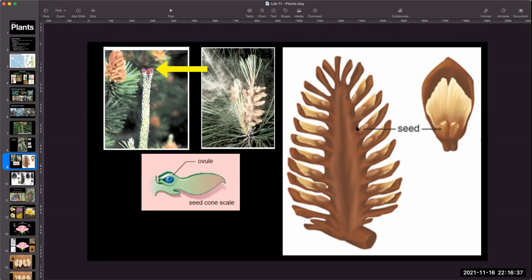But if we roll back time a little bit, what happened here was pollen went down through these grooves and ended up right here next to this ovule. Now this ovule secretes a little bitty drop of sticky fluid, and that pollen grain lands there. It just falls there, thanks wind. And then that leads to fertilization of the ovule. And the ovule, then we just change its name. We call it a seed. So yeah, seed was an ovule.